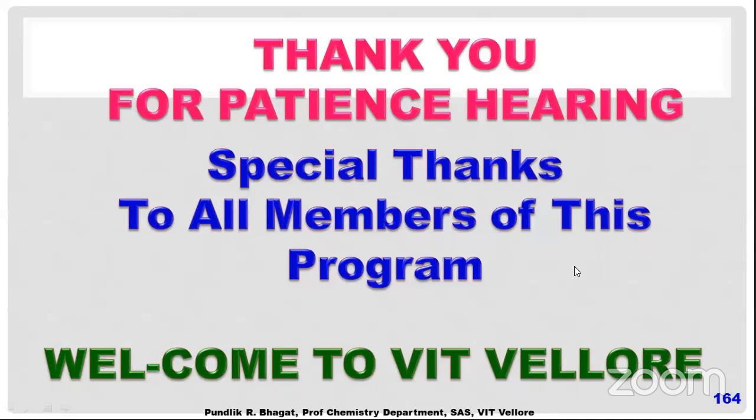My question is, in 2-amino 5-nitrothiazole, I am getting two lambda values. One highest lambda is 386 nanometer, which is also reported in the paper, but I am also getting a lower peak, though there should be only one peak. The question is why we are getting two peaks. Another lambda comes at a lower value, so I don't know why two lambda are appearing in the same graph.